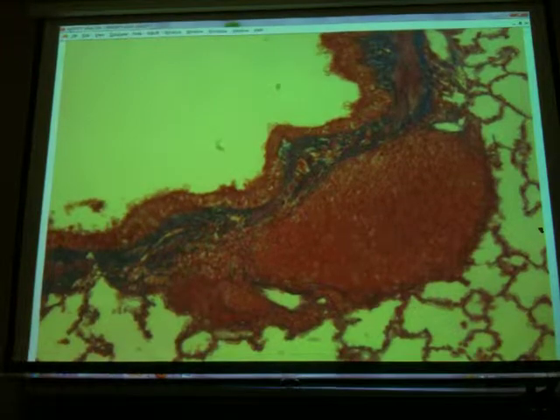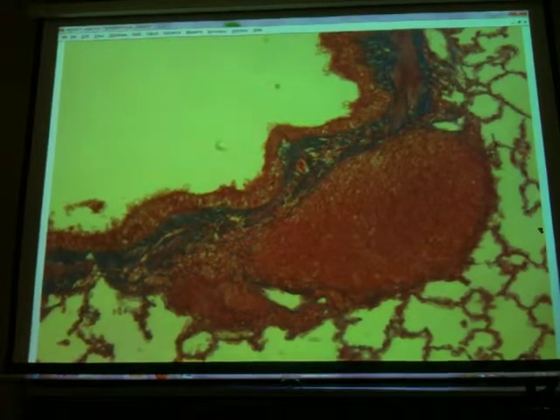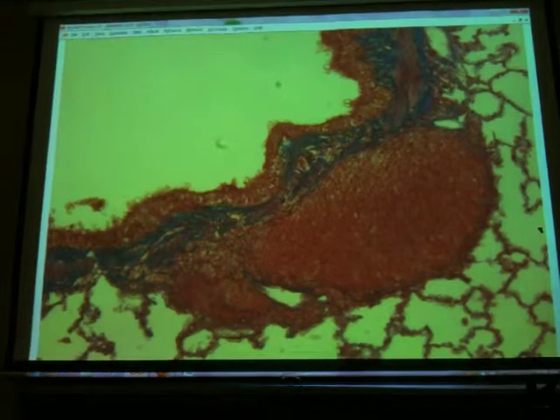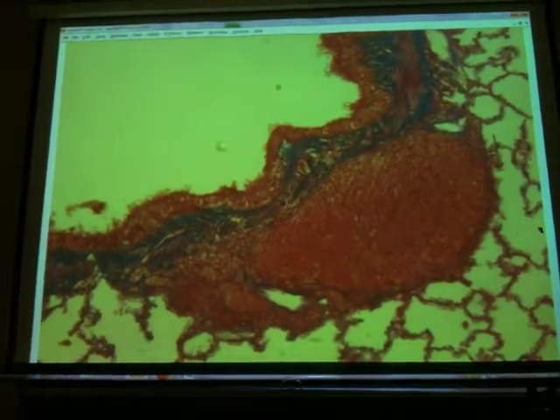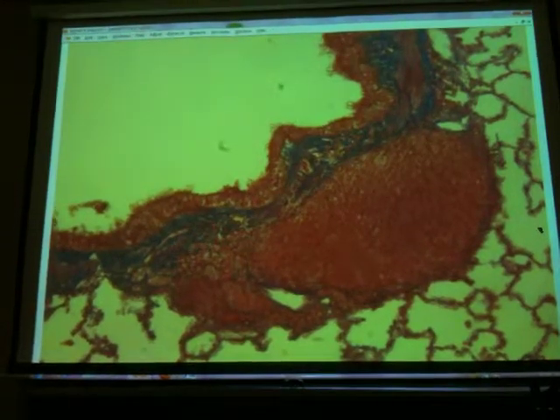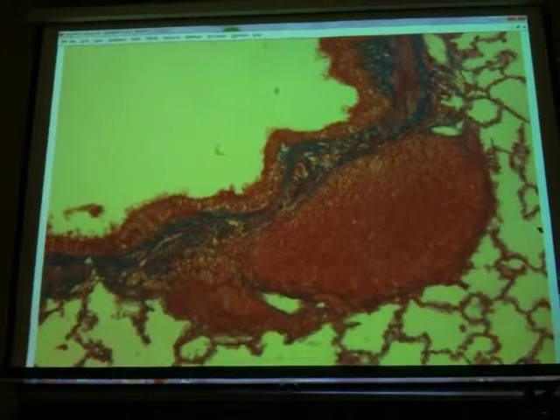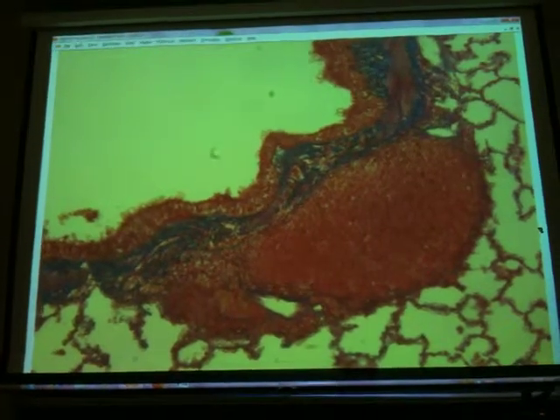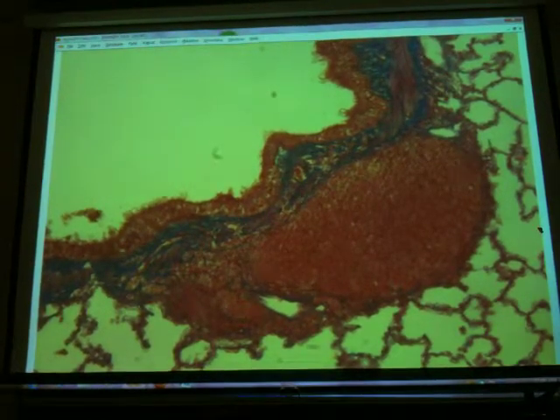And it's part of the system called BALT, bronchus-associated lymphatic tissue. Okay. We have BALT, we have GALT, gut-associated lymphatic tissue. I think those are clinical terms. I'm not sure if your book is offering them anymore. But that is a lymph nodule, and it's because the airway can be bringing pathogens in, and it's going to help do some cleaning.